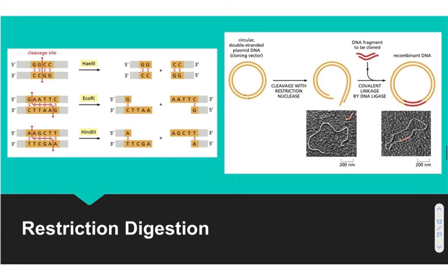So now we come to restriction digestion. Restriction enzymes are super cool. So they're a defense mechanism developed by bacteria in order to avoid bacteriophage infection. Bacteriophages are viruses that infect bacteria, and bacteria avoid their infection because phages work by injecting their DNA into the bacterium.